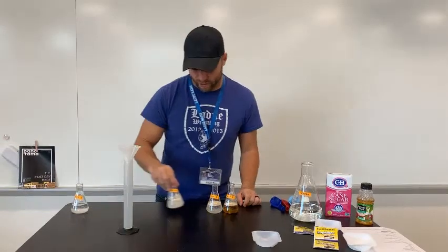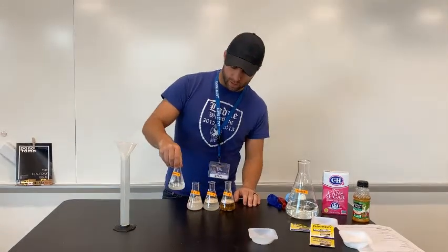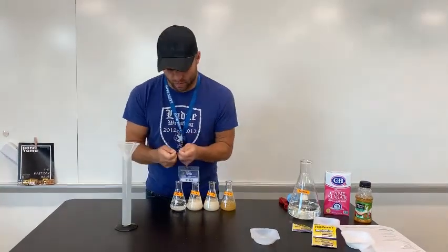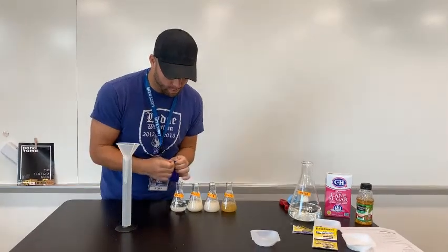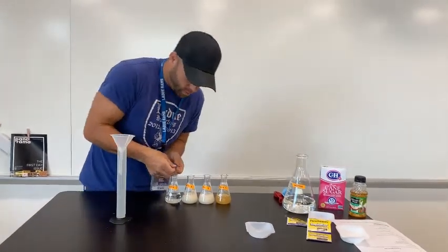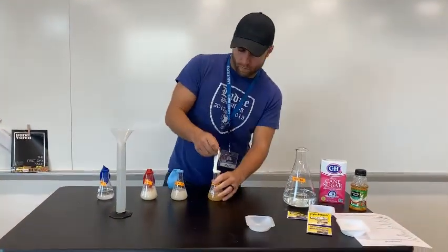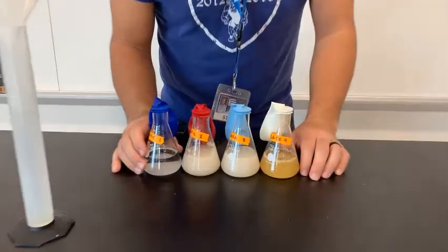Now what we're going to do is bring them back over here, give them a little shake, and then we will cover them with balloons. These have been pre-stretched. Just shake these up, then lift the balloon and do not knock over the flasks. All right, that's flasks one, two, three, and four. Now we're going to let them sit overnight.